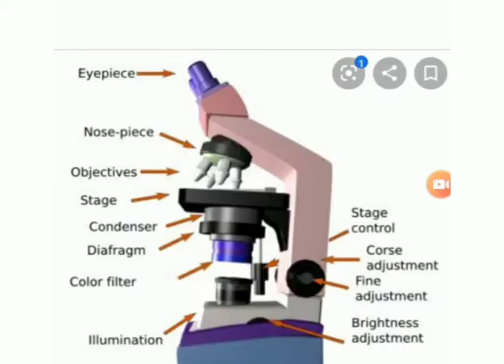Assalamualaikum. My task today is to demonstrate the use of a light microscope. First of all, clean the slide with gauze, then place the slide with tissue on the stage of the microscope.